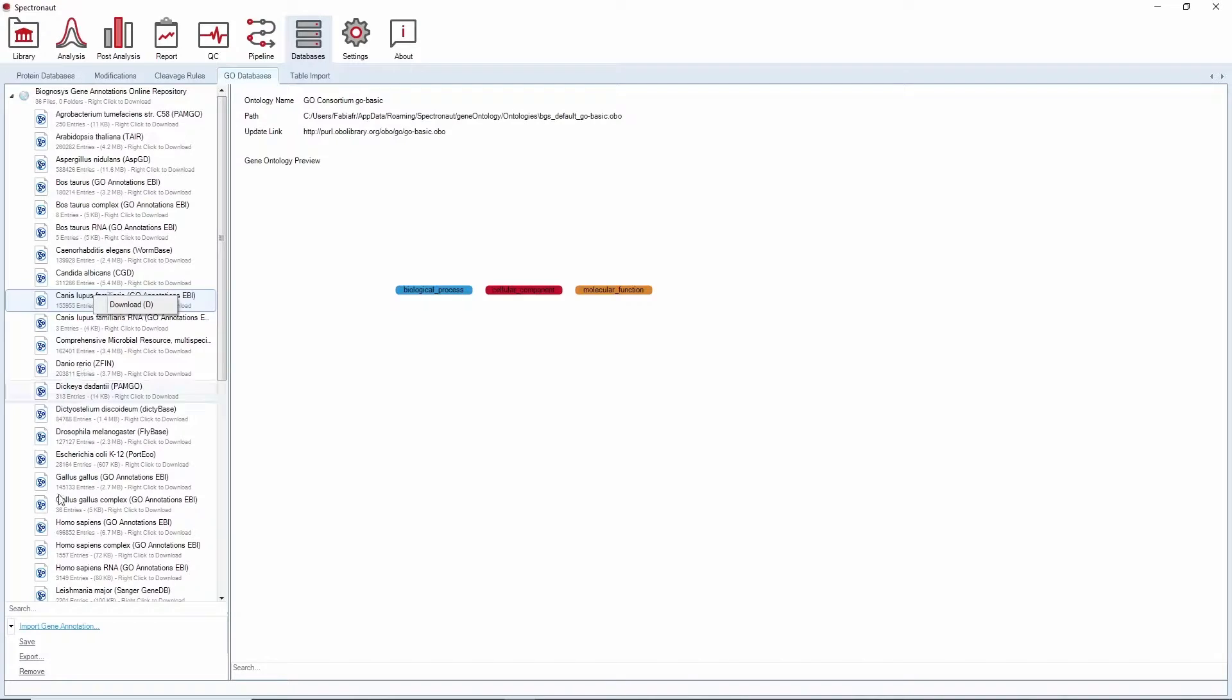You can also import your own resources by clicking on the import action in the bottom left panel. Once we have all the resources, we are ready to start our analysis.